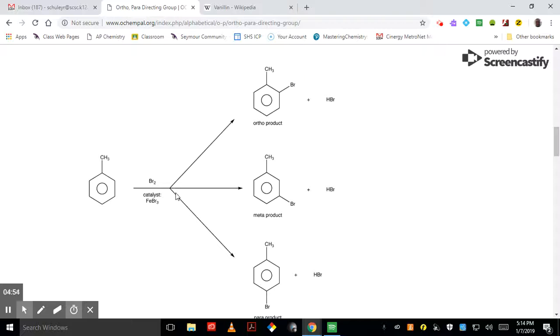Well, it turns out that what we're going to do is use KBrO3 and hydrobromic acid, HBr. The reaction between those two is going to create the bromine, and we don't have to use this noxious bromine. So keep in mind that we're going to produce the bromine in situ by doing that, as opposed to having to add the noxious bromine. But this is a very common way that it's done.